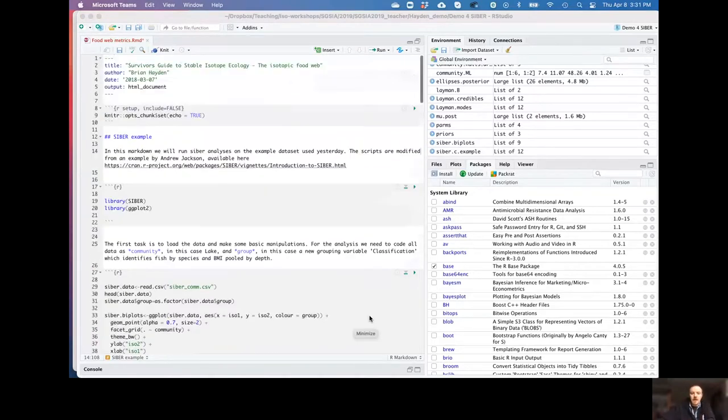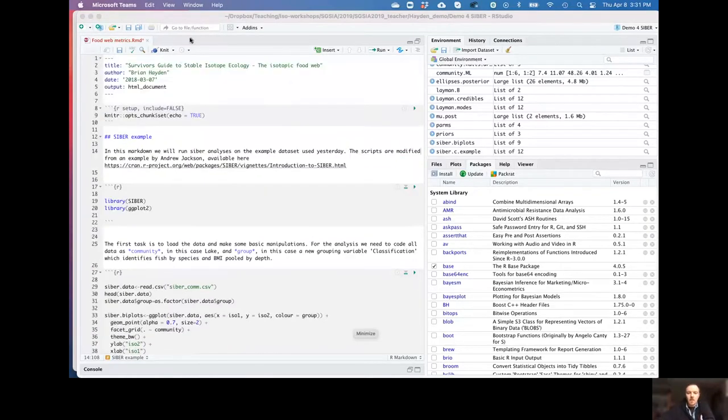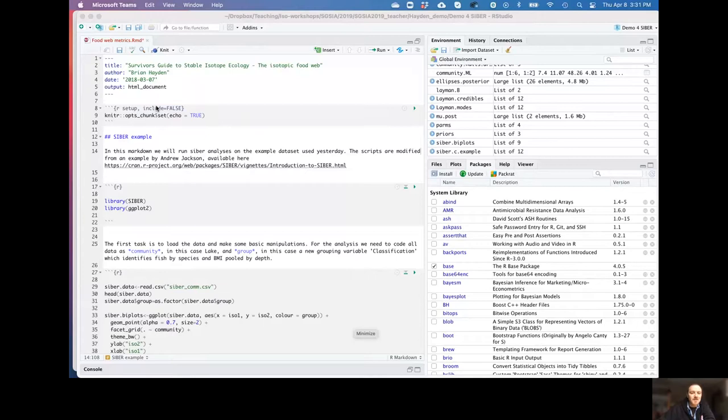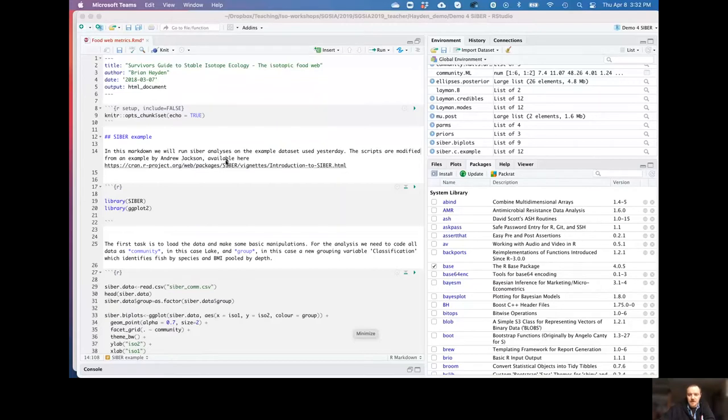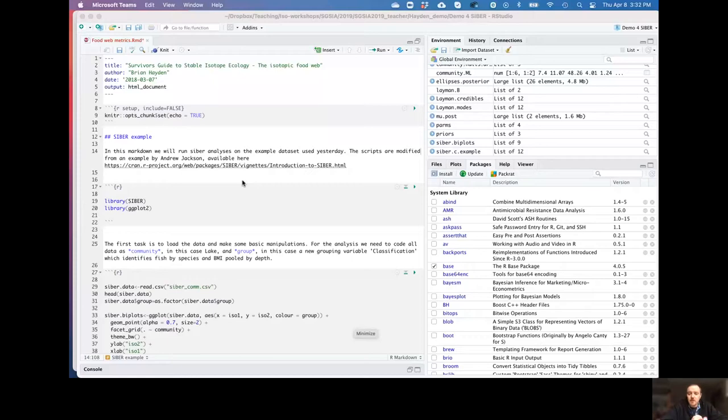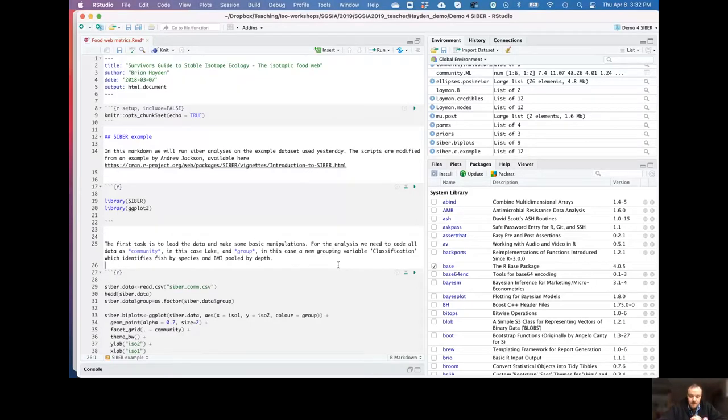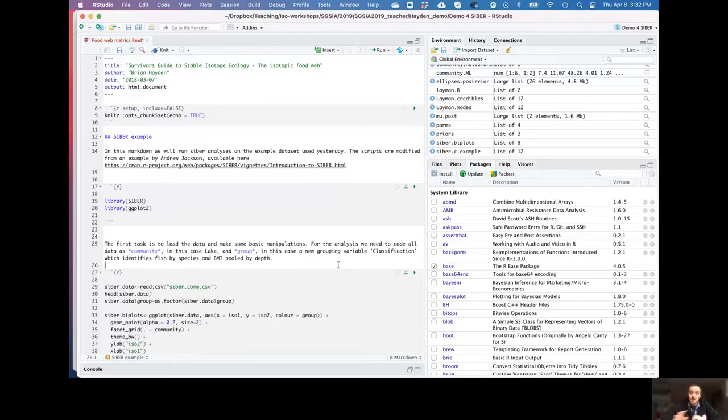So again, we have our R script set up ready to run. Everything is here in R studio. And we've modified this again from an example by Andrew Jackson, and here's a link to his website where he goes through this in a bit more detail. But you'll see as we go through this, a lot of it is very similar to what we had with the niche width stuff, but rather than looking at populations, we're now going to look across the community.